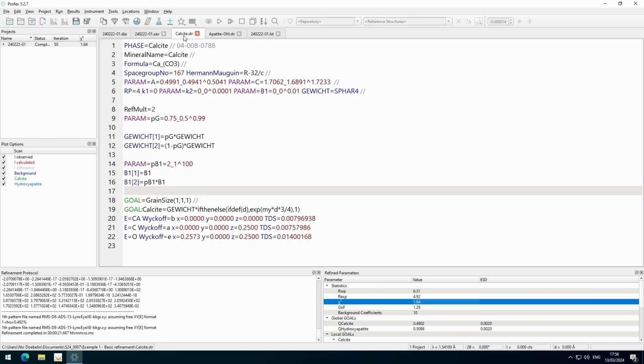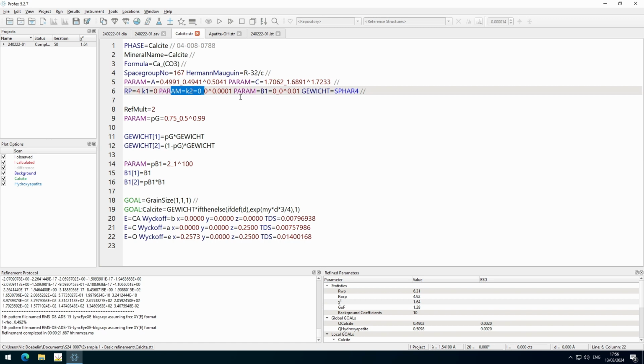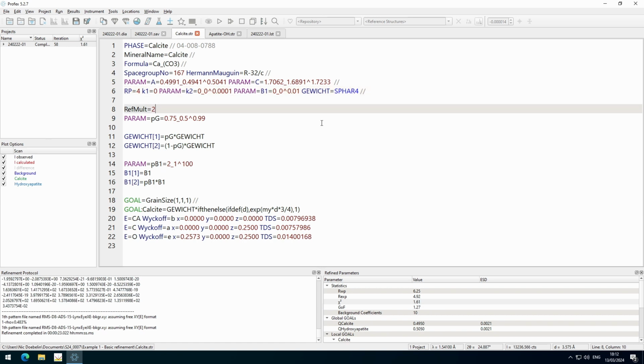So now if we look at the refinement, we refine microstrain and we refine bimodal crystallite size distribution and a moderate texture model. Now before we continue and try to refine the substitutions on the calcium sites, let's just try to max out the refinement of the profile.